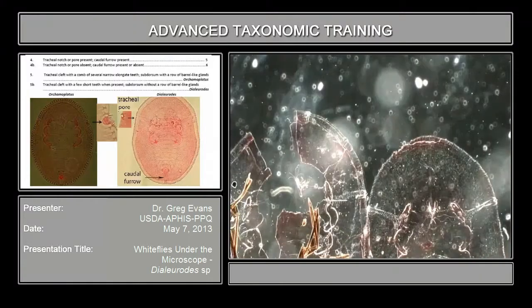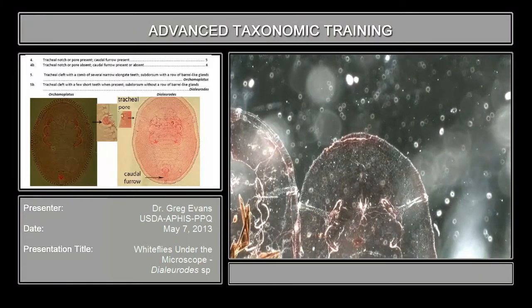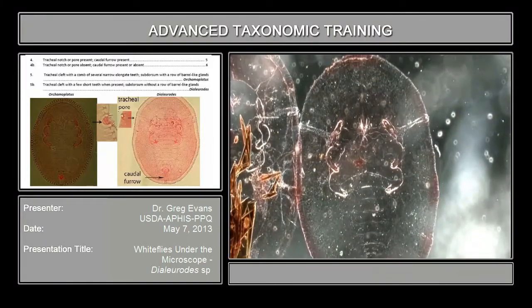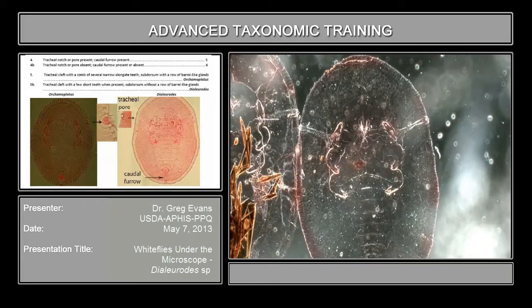If we move to the Dialerodes slide, this may be easier to see in this view. You can see the caudal and the tracheal furrow along here very well.